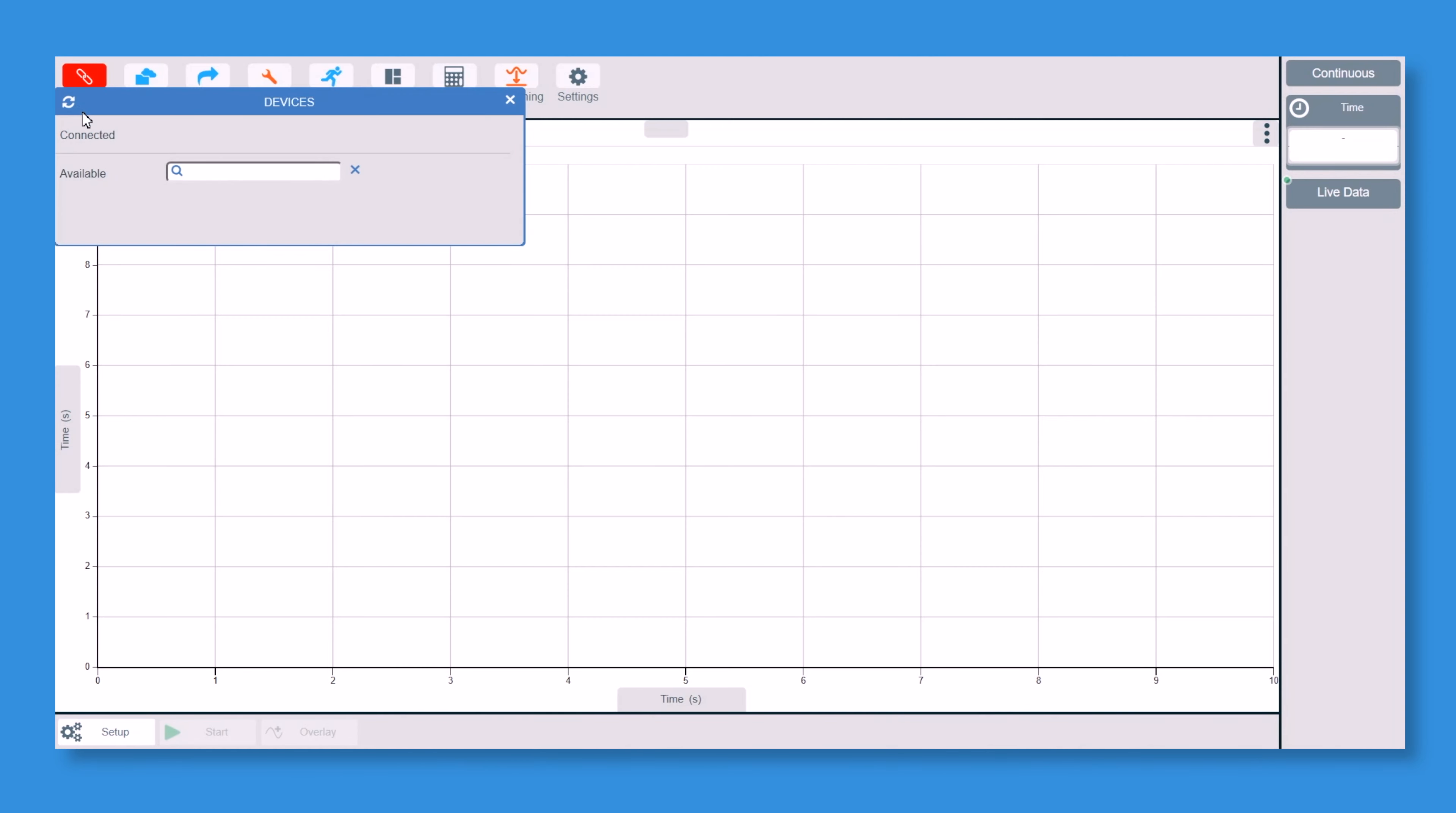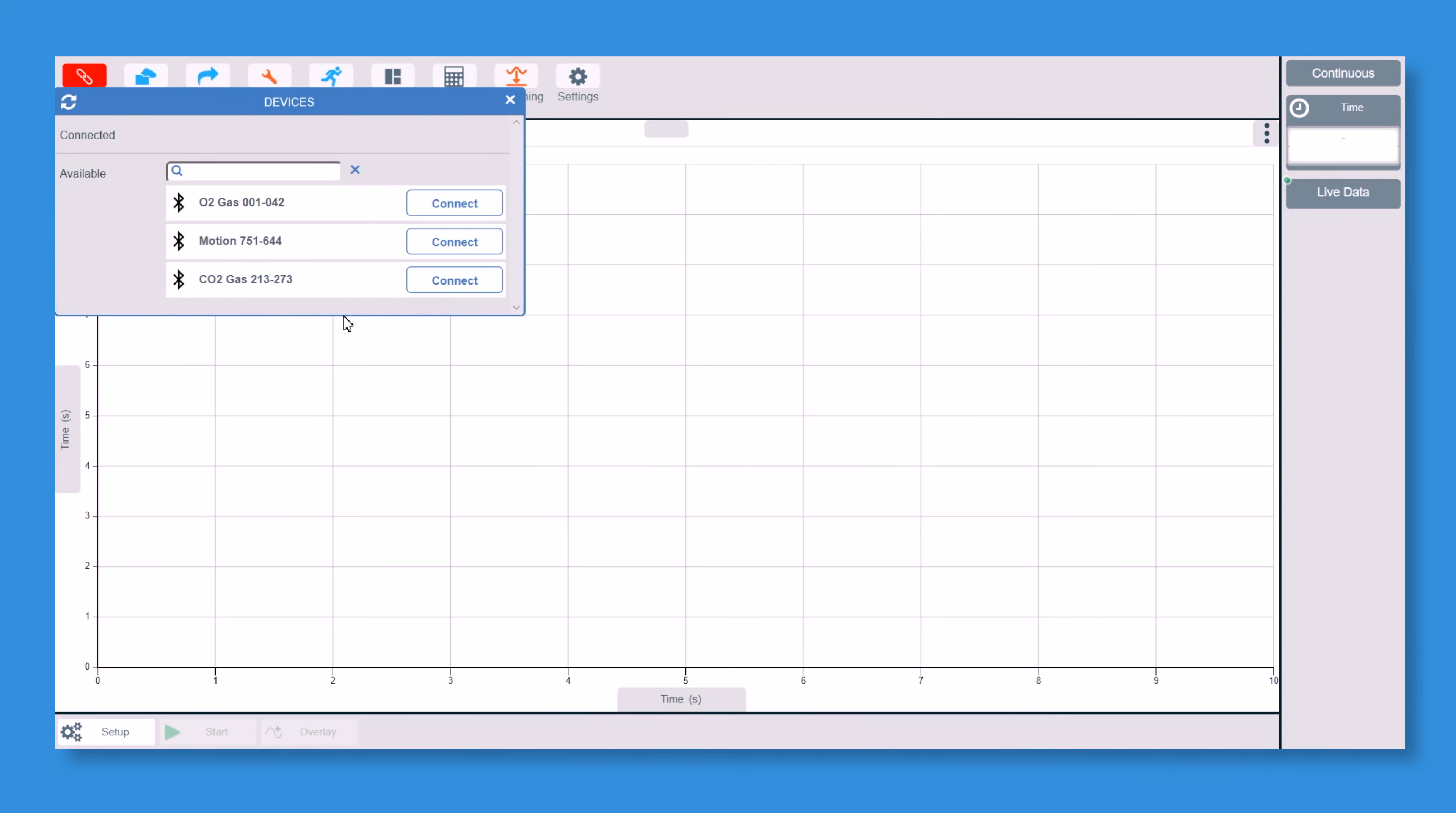If I go and click devices at the top here, it's picking them both up on there. Oh, I didn't turn CO2 on, let's turn that again. There we go, so we're now turned on on there.